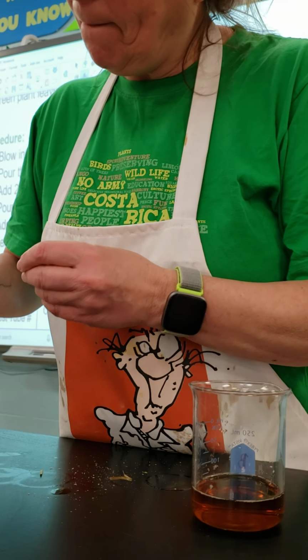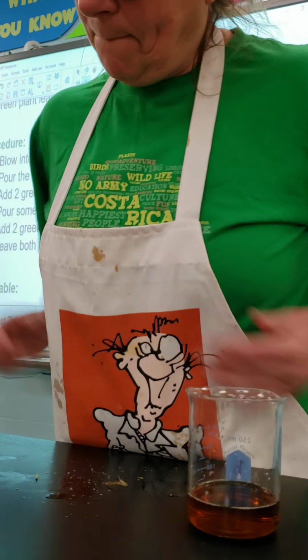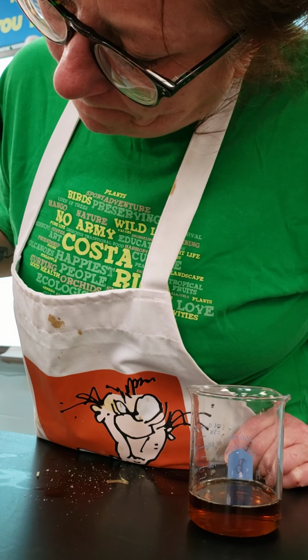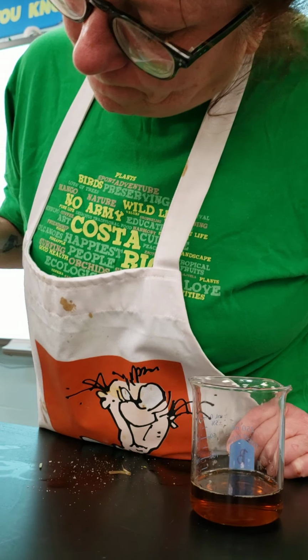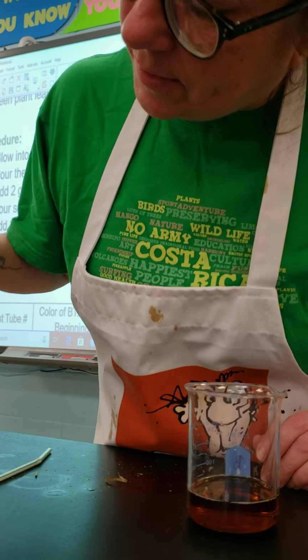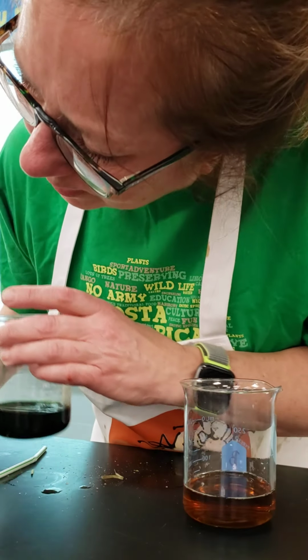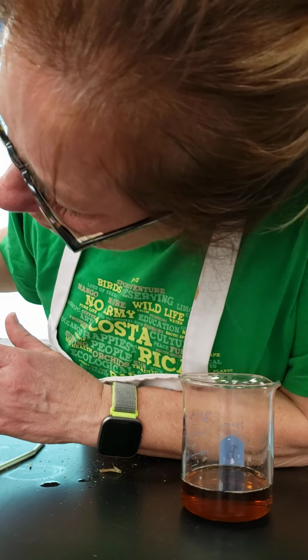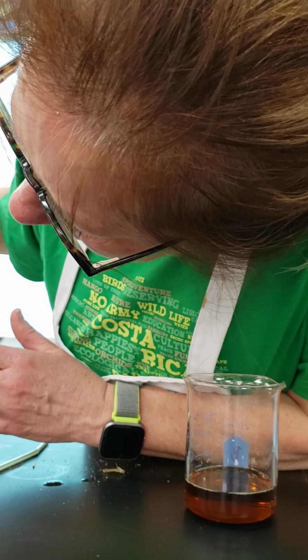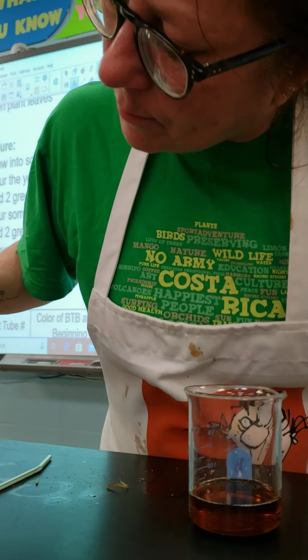Okay. Once again, push them down in there. Okay. I'm going to leave those sit. Actually, I'm going to make it so I've got about the same amount of liquid in both. I've got 2 leaves. Got about the same amount of liquid in both.